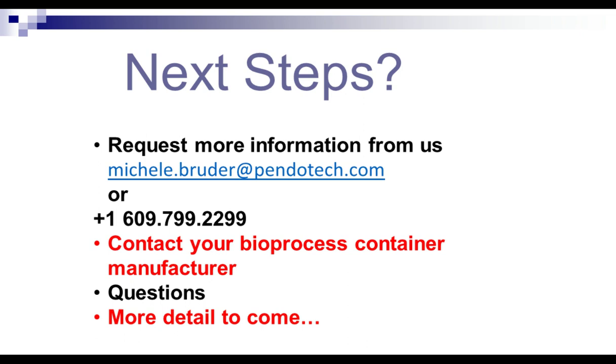So the inline sensor, that's an interesting question because how is this different from other applications previously? The inline sensor has previously been used using a loop.